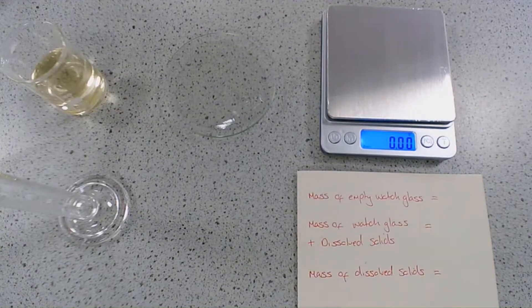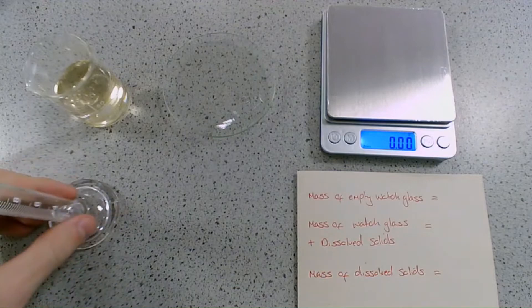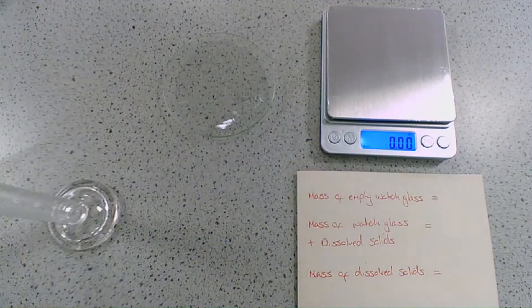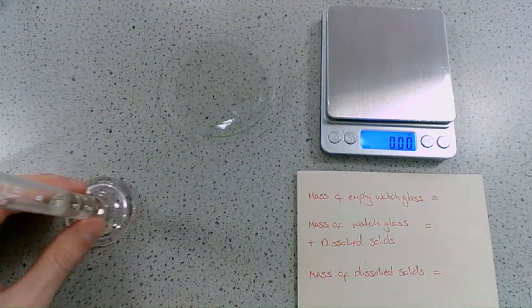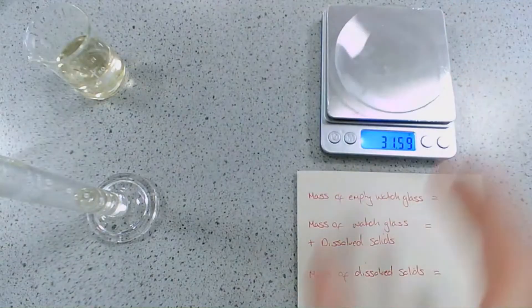The last thing we're going to look at is how we determine the mass of dissolved solids in a water sample. We're going to use the seawater because it will give us the greatest amount of dissolved solids. To do this, all we need is a measuring cylinder, a watch glass, a balance, and a Bunsen burner. We're going to measure out 4 centimetres cubed of our seawater sample into our measuring cylinder, and before we add it to our watch glass, we need to make sure we measure its mass.